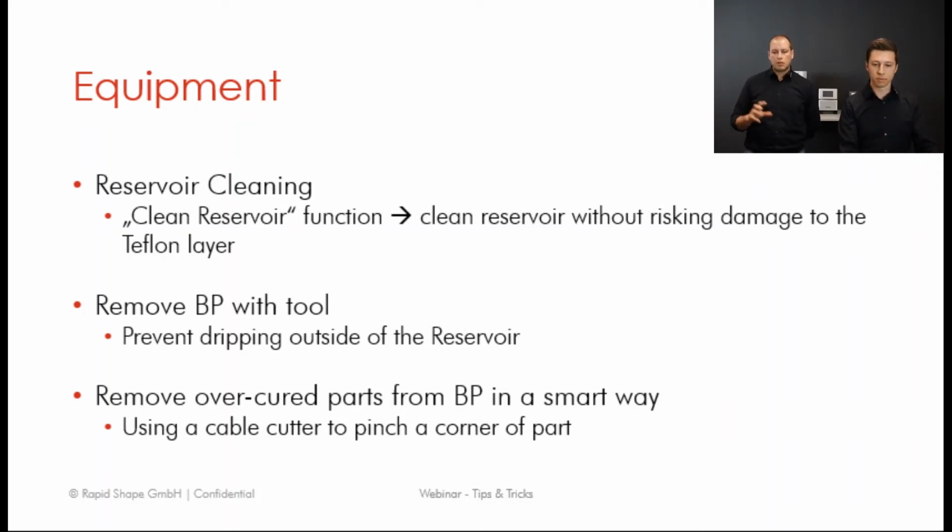But this is something that you can adjust if you're familiar with it. Otherwise, we can assist for this process. It is fairly straightforward. There's a screw, and there's a nut that secures the screw. To adjust this, you need to loosen the nut, tighten the screw, or loosen the screw if you need to activate the switch sooner or later, depending on the orientation, and then tighten the nut that secures the screw again. You just have to be careful, because if you're adjusting it too much, the platform won't stop if there's some issue with the machine, because the limit switch is really there for safety reasons.